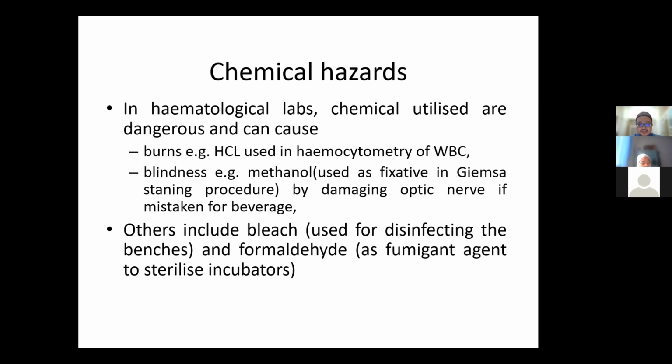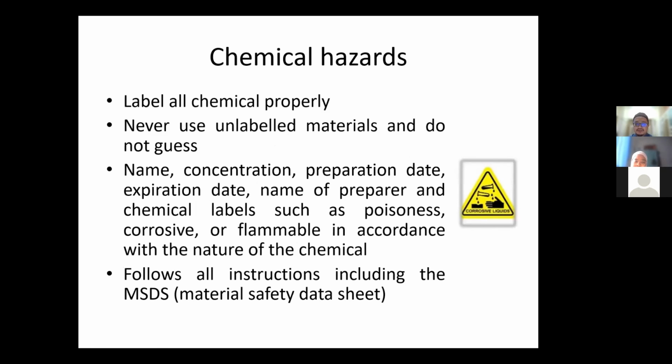Others include bleach and also formaldehyde. So we need to label all chemicals properly, never use unlabeled materials, and never guess what the material is. A good lab practice must name, write down the concentration, the preparation date, etc. Everything here.